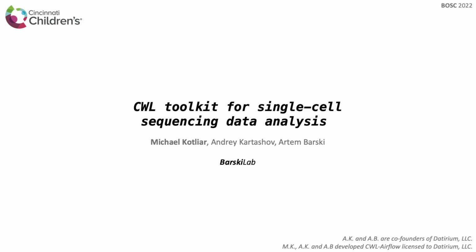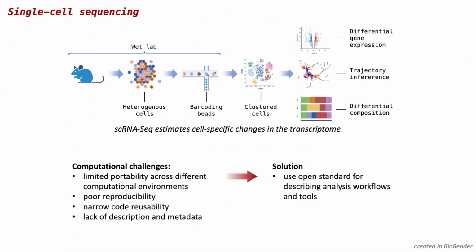For the last 6 years, I do data analysis and develop computational pipelines at Cincinnati Children's Hospital Medical Center. Today I'm going to present you a set of CWL tools that will make your single-cell data analysis much easier and way more reproducible. Before we get to the actual workflows, just a few words about single-cell technology. I will use droplet-based single-cell RNA-seq as an example.